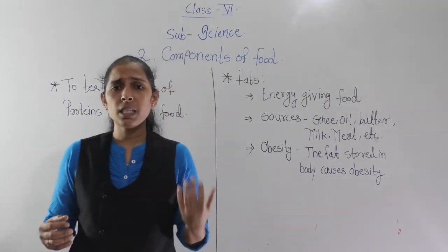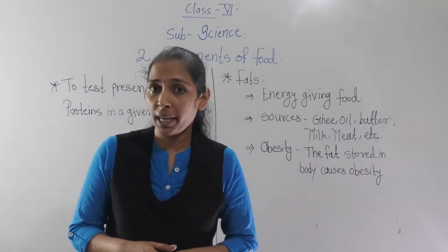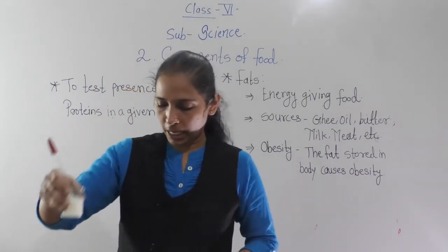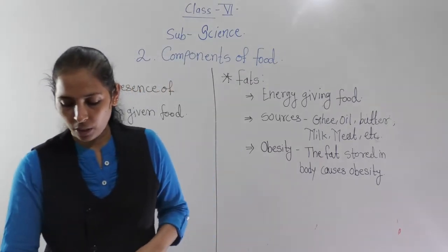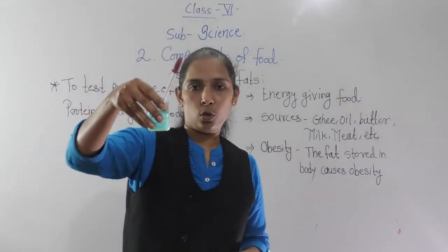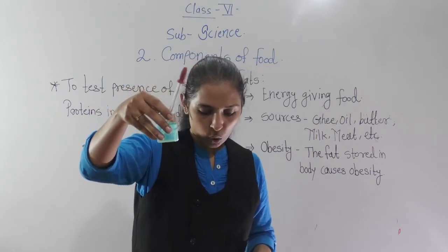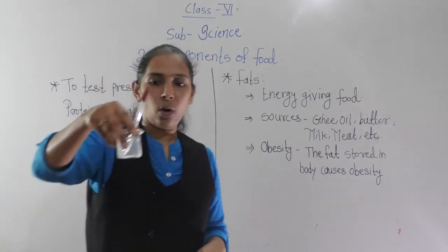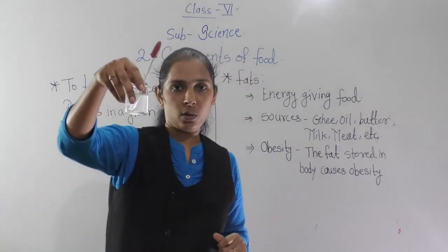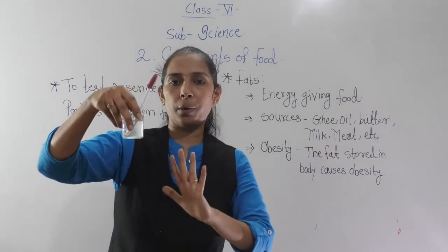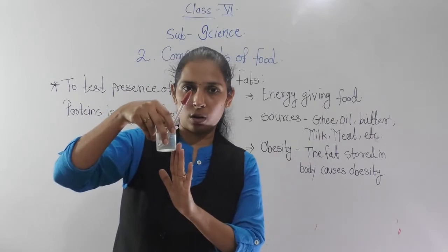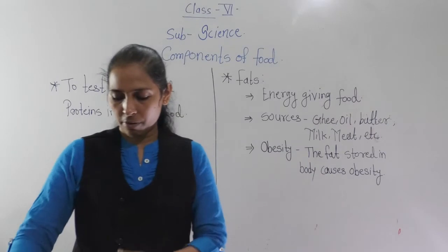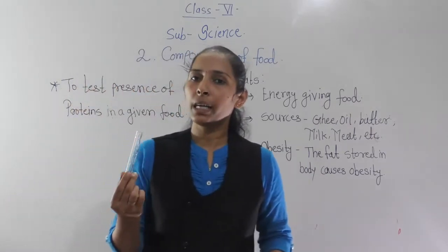Instead of boiled egg as given in the book, I have taken milk here. I have also taken copper sulphate solution, and I have taken caustic soda — caustic soda means sodium hydroxide. I have already prepared the solution of caustic soda and the solution of copper sulphate. We also require some droppers and a testing tube.